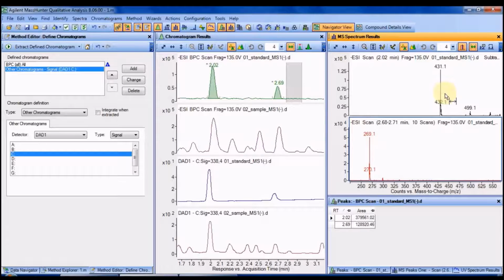We can see that both compounds give almost exclusively deprotonated ions, and generally in negative mode fewer adducts are observed, as well as fewer fragments, which contributes to better sensitivity. Additionally, both compounds are phenols, and thus they are acidic, and they give a stronger signal in negative mode than in positive, which together with a lower and cleaner baseline allows for much more sensitive analysis.